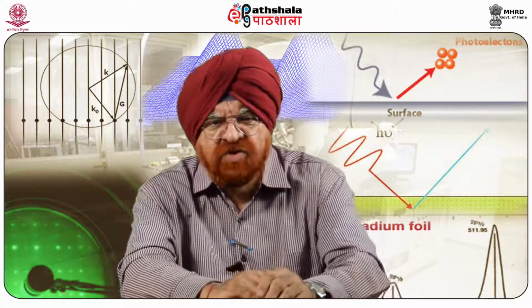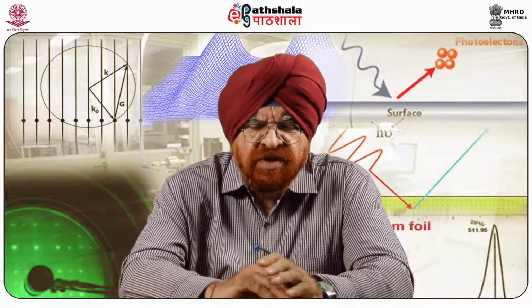That is, in what way the interaction will be monitored and what the changes are. Other topics to be considered are the properties of a suitable probe, the achievable spatial resolution, and the inherent restriction of this particular method. More detailed information can be found in articles by Rugar et al., Hartmann, etc. Valuable information can also be found in the work of Koch and Hendrich et al.